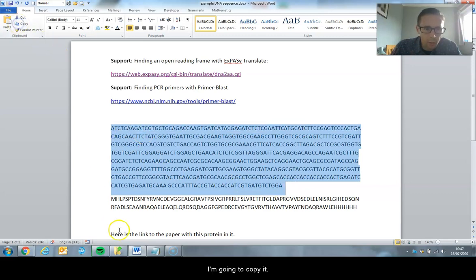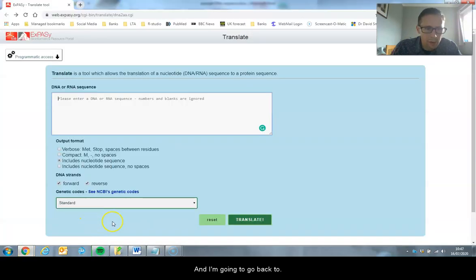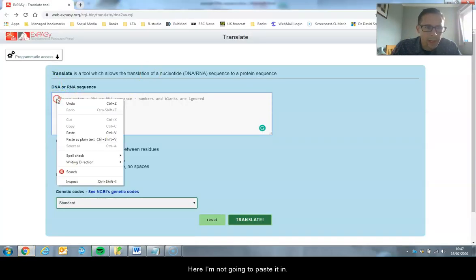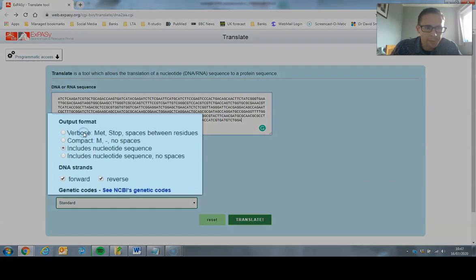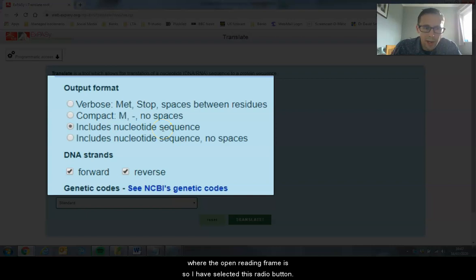I'm going back to the Translate tool. Now I'm going to paste it in, and I want to be able to see on the nucleotide sequence where the open reading frame is, so I've selected this radio button.